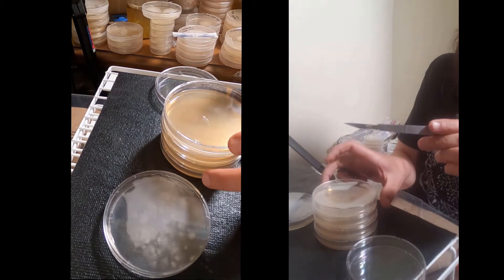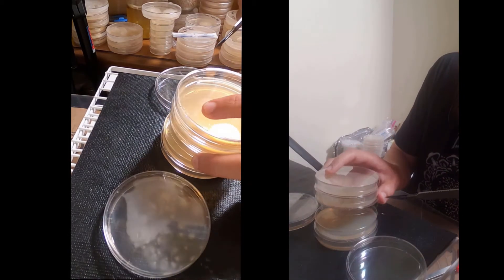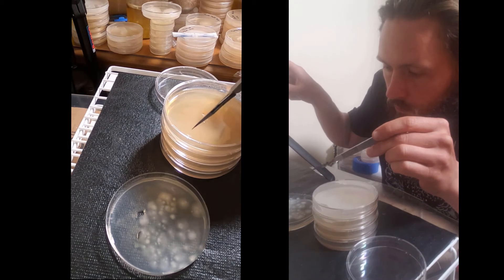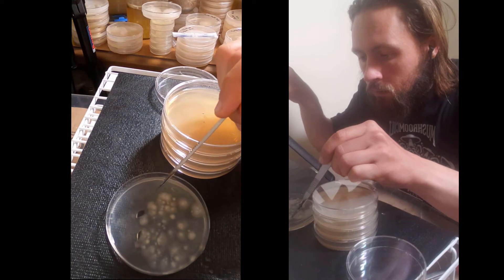What I'm doing here is carefully flaming my blade and cooling off the blade in the clean plate, and then I'm looking in here and seeing which colony has a leading edge where I can see vigorous mycelium that I'll be able to separate from the rest of the plate.